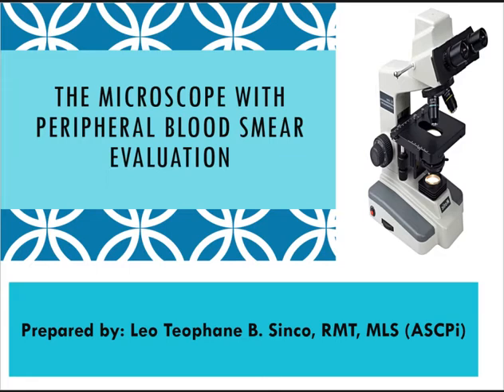For this discussion, we are going to talk about the microscope's history, who contributed to the making of your microscope to what it is now. Then we are also going to talk about the people behind it. We also have third one. We are going to talk about its parts, the different functions of each part of your microscope. And then we are also going to talk about the different types of microscopes.